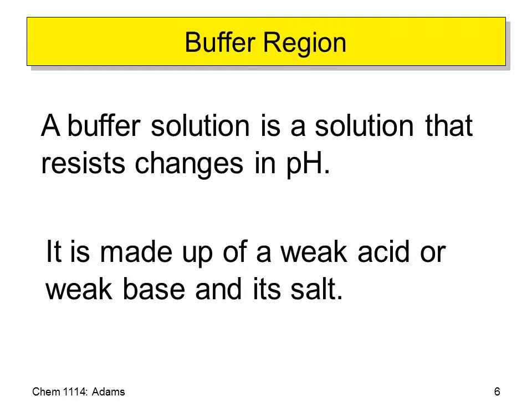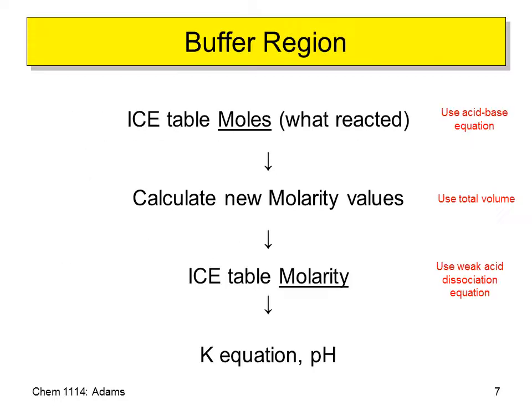And a buffer is made up of a weak acid or a weak base. Here it's the weak acid because we've got the ascorbic acid and its salt. You're going to see this slide a number of times during this presentation.